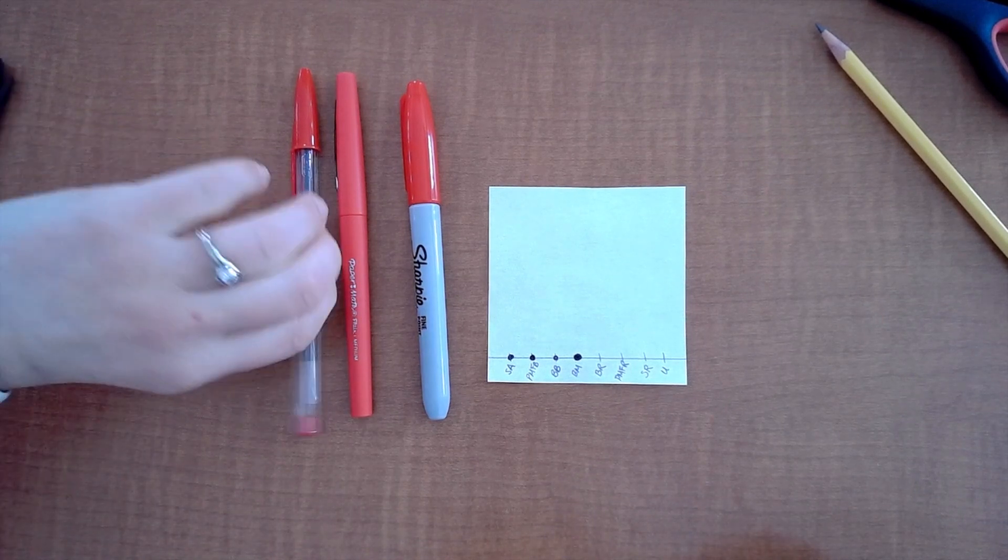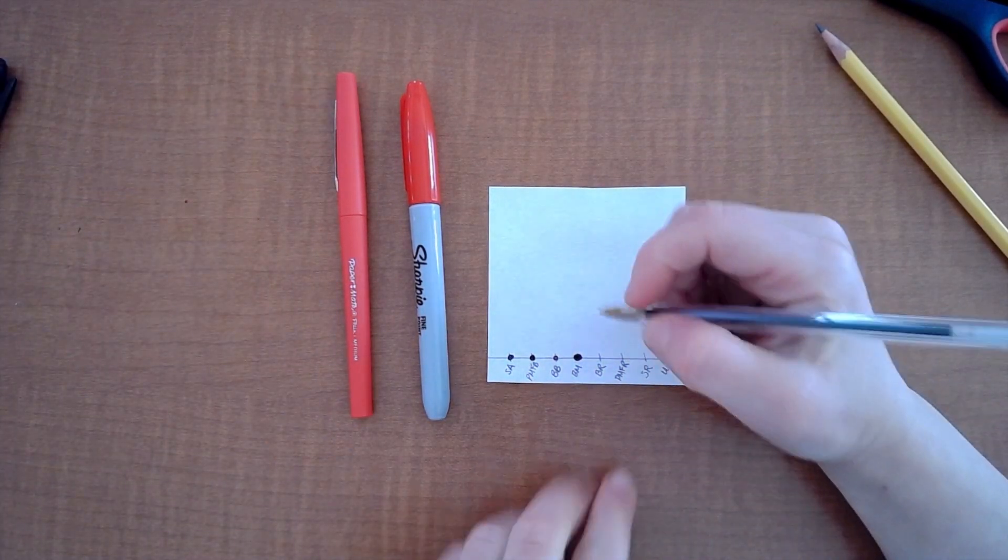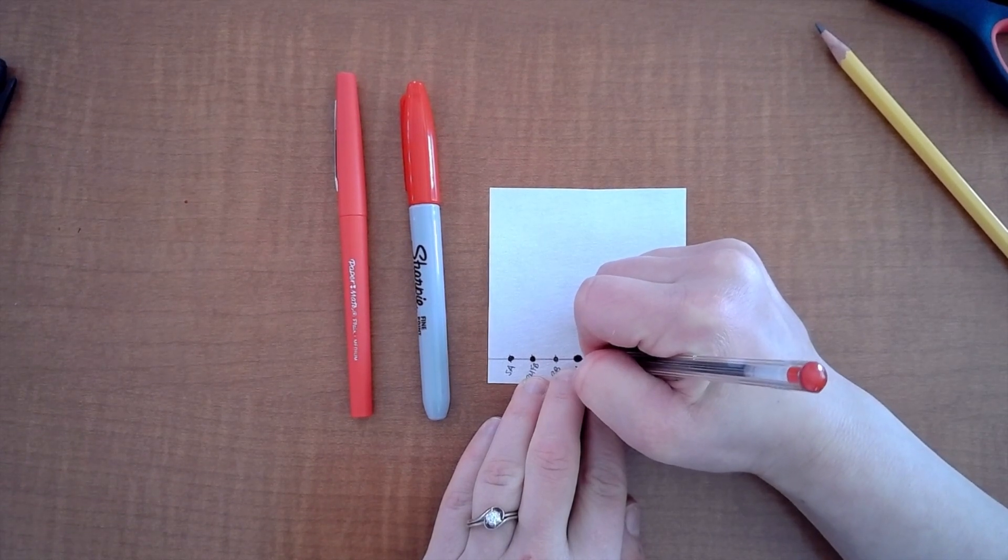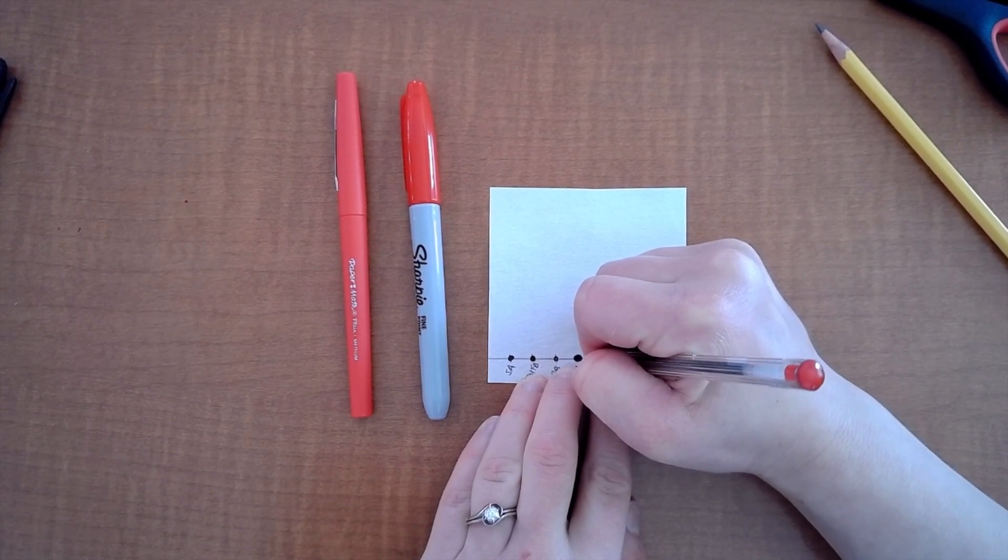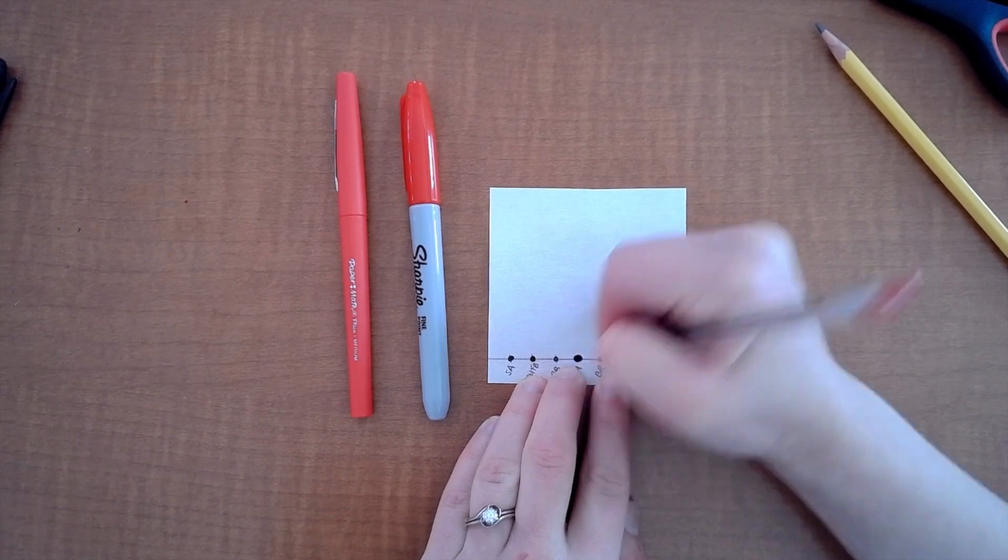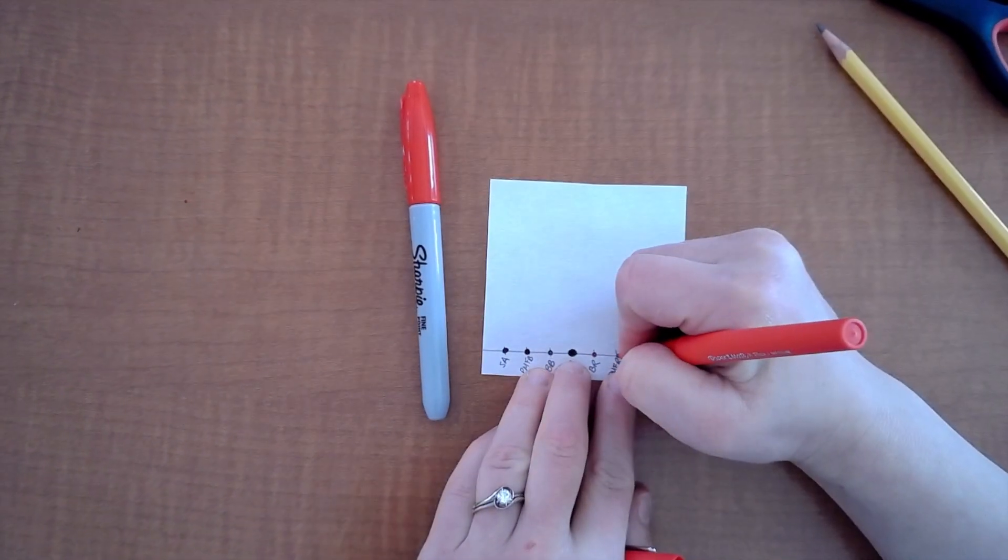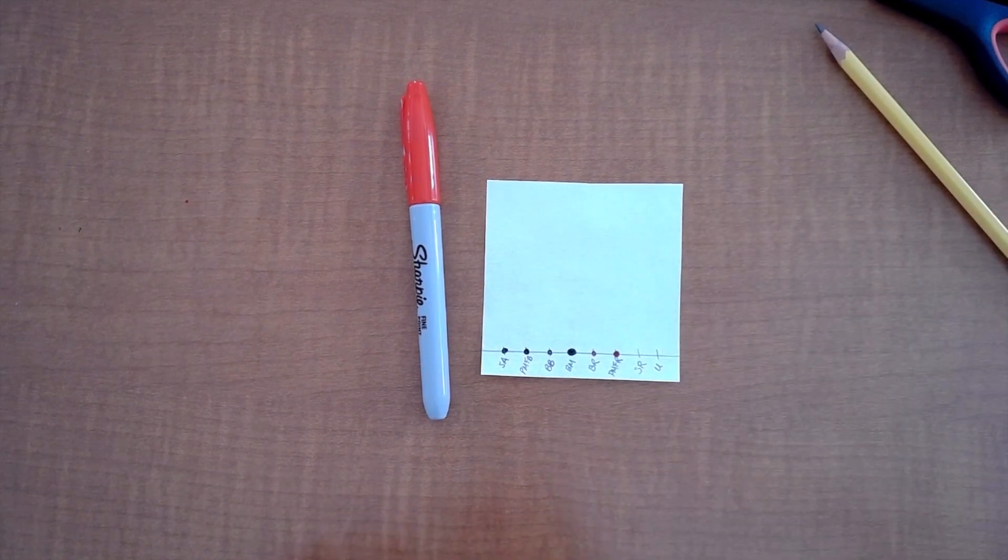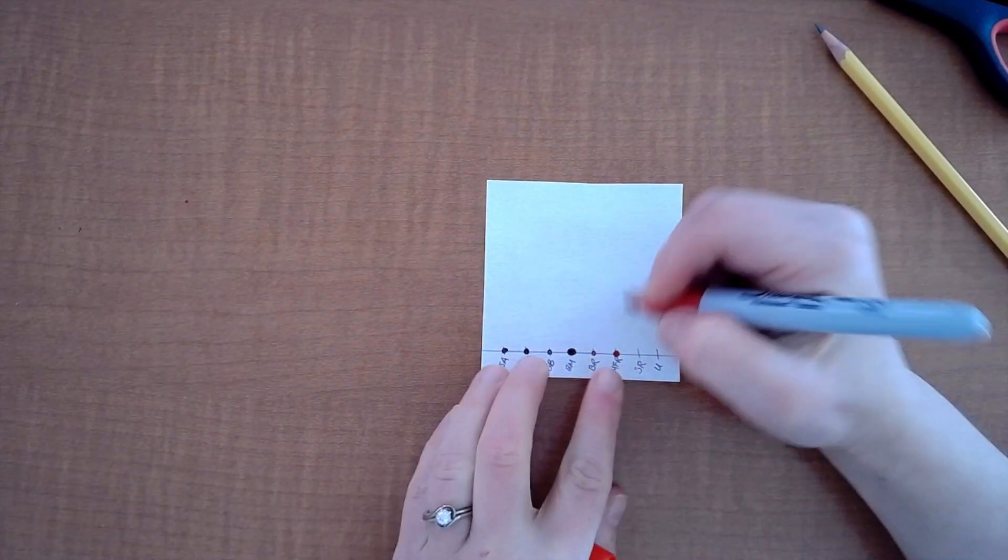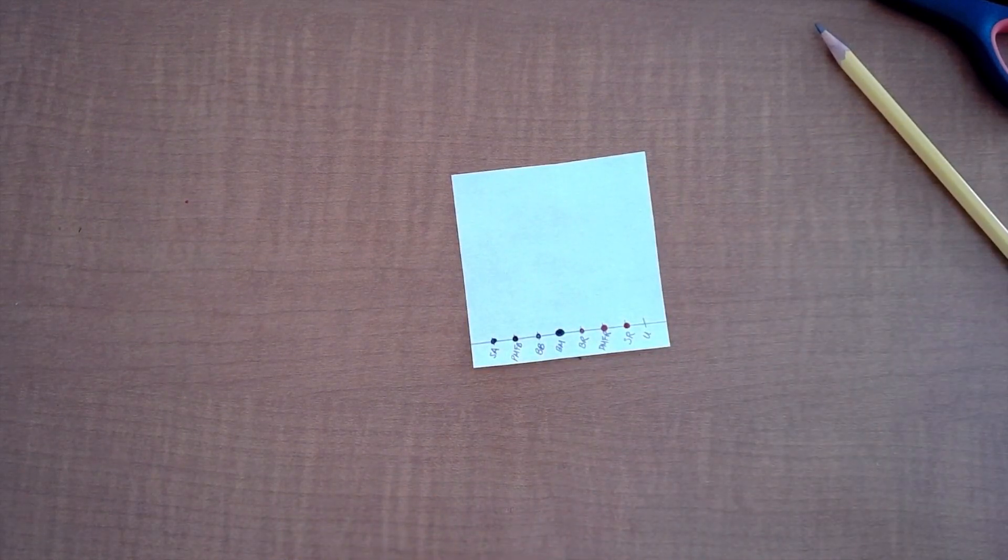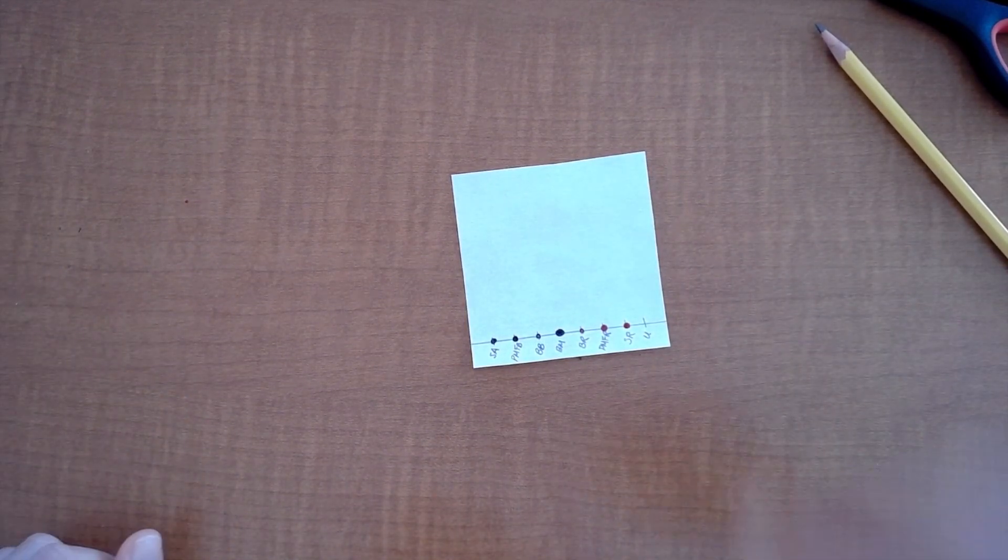Now notice I'm actually using the markers and pens. Everything else was pencil. You want to make sure that you only put the marking and markers where you need it. So here's our Bic red pen and here's our Paper Mate Flair red and here's our Sharpie red.